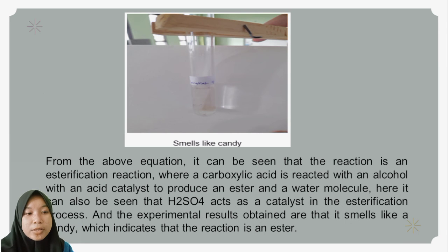From the above equation, it can be seen that the reaction is an esterification reaction where a carboxylic acid reacts with an alcohol with an acid catalyst to produce an ester and a water molecule. Here it can also be seen that sulfuric acid is a catalyst in the esterification process. And the experimental result obtained is that it smells like candy, which indicates that the product is an ester.